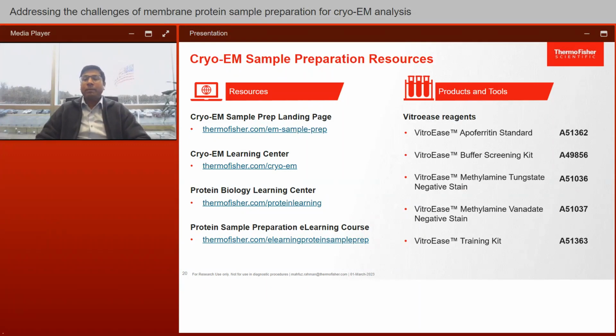To sum up, I have talked about the protein prep focusing on cryo-EM, and I discussed the related challenges during vitrification and a simple screening method for the optimization. Almost everything from my talk is available on our website and in the white paper. As products, we have apoferritin standard, buffer screening kit, training kit, and negative stain.